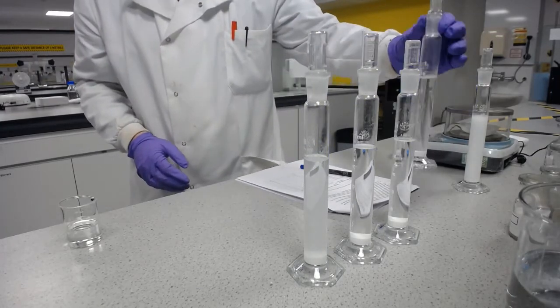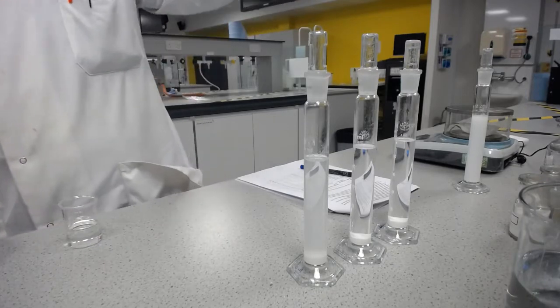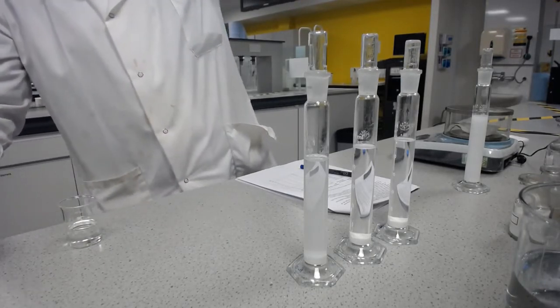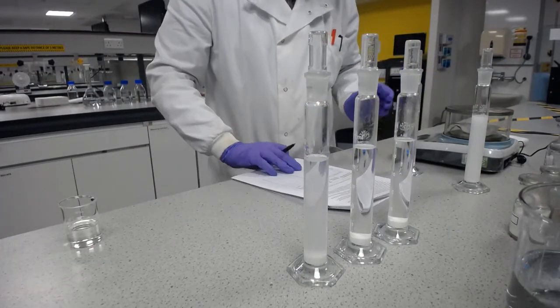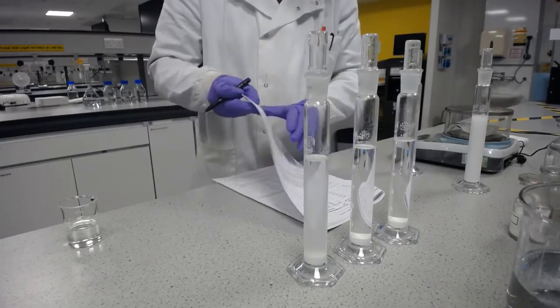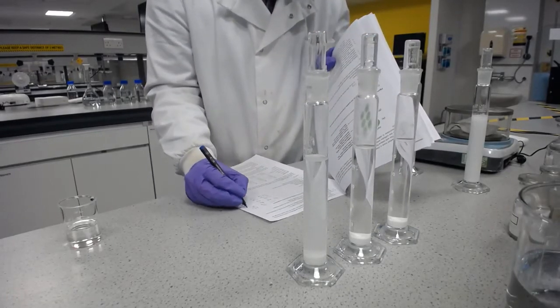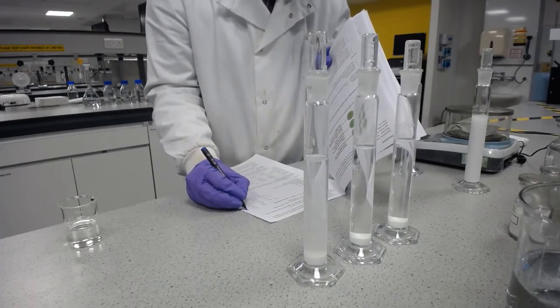So let's move on to this one, the lowest strength electrolyte, 1 millimolar. With the vast majority of them, we can see that this has gone down, and this ended up after over an hour at about 2.5 over 50 for the sedimentation. Just going to write these down. Here we go. So yeah, 2.5 over 50.